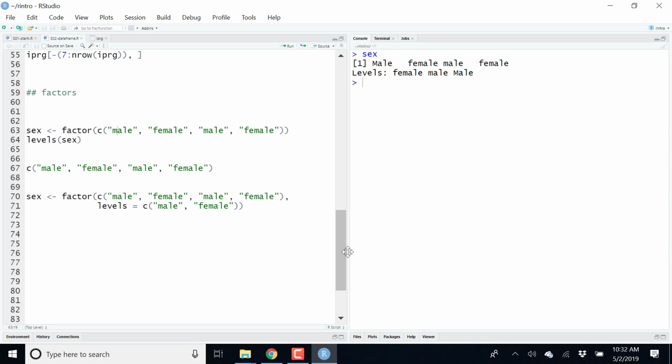So very often, when we read data in, it might be worth thinking about whether the data that we have is meant to be a factor or not. Typically, if we read the data in and we have these protein identifiers, do we really want these to be factors? Do we define that these are all the possible protein identifiers that we expect to see?